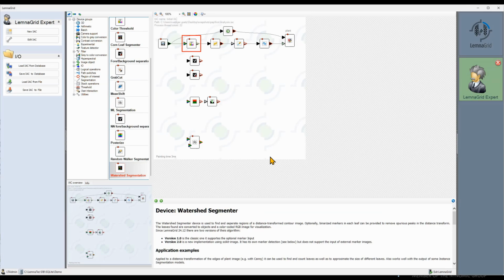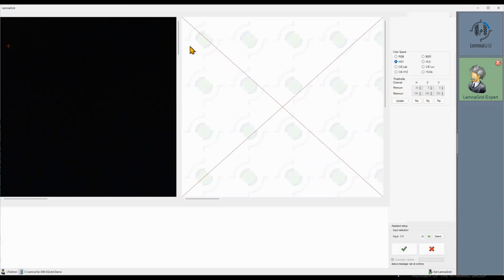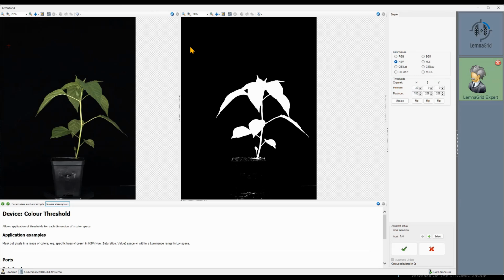We have a few more options in this device. In the last video, we used the HSV color space, but we could use others. The HLS color space is essentially a variation of the HSV color space. The brightness value is now called lightness. The value for saturation and lightness are calculated a bit different. The CIELAB and the CIELUV color spaces might be more interesting.